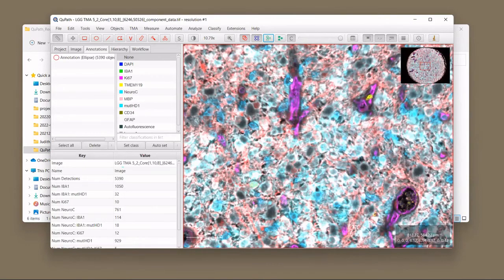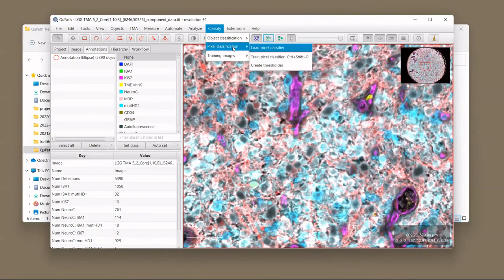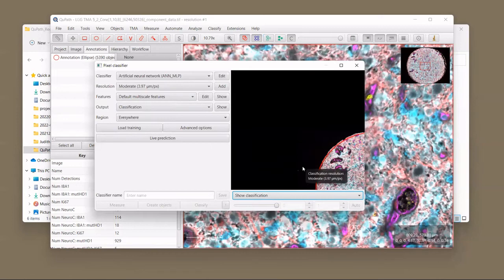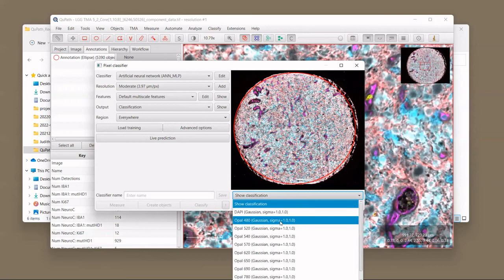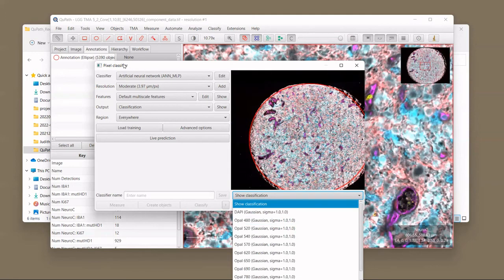I want to point out that for the CD34 channel, setting a simple threshold was enough to classify the vessels. There's also more advanced pixel classification — the standard Train a Pixel Classifier. In a classical pixel classifier, you annotate pixels of certain classes, and the classifier uses filtered versions of your image to decide whether a pixel belongs to a certain class. This creates a much more complex classifier that takes much more information into account, and it's worth checking out.